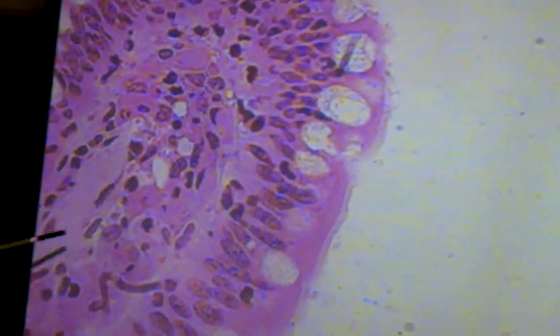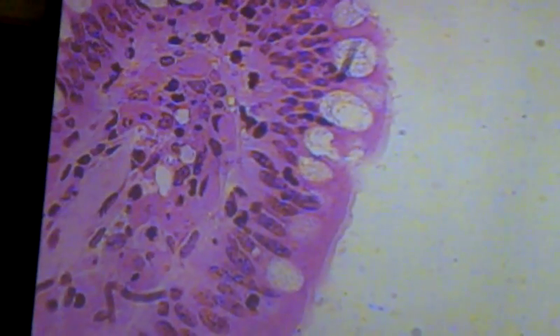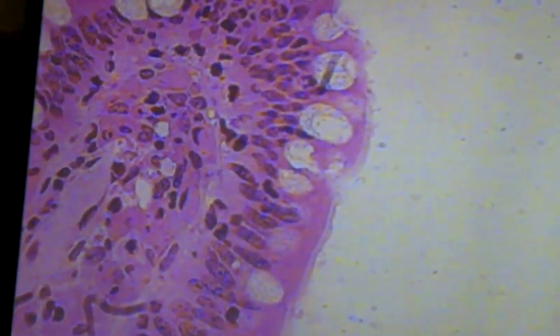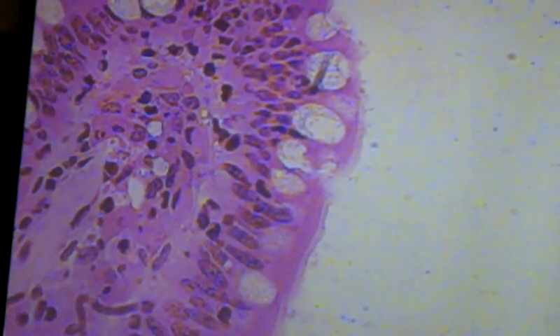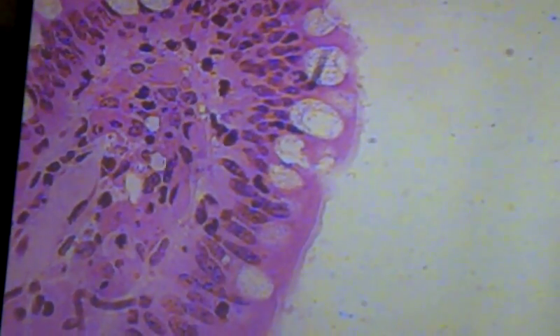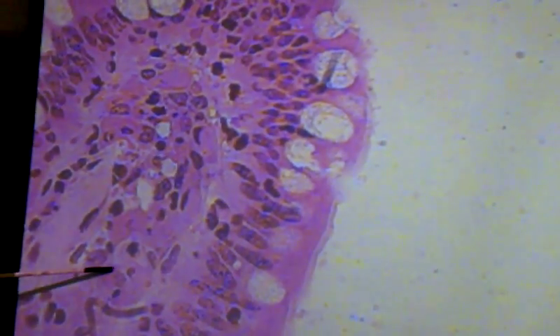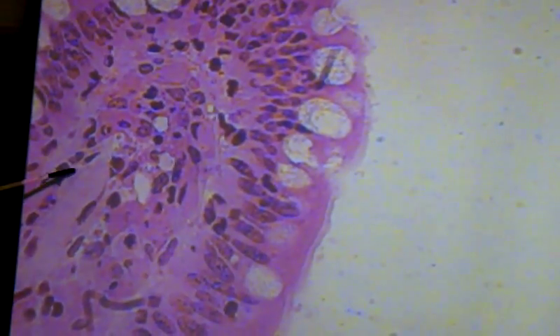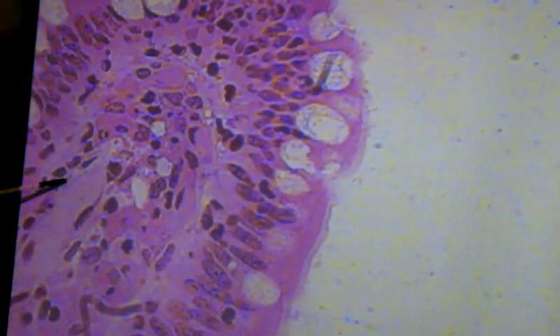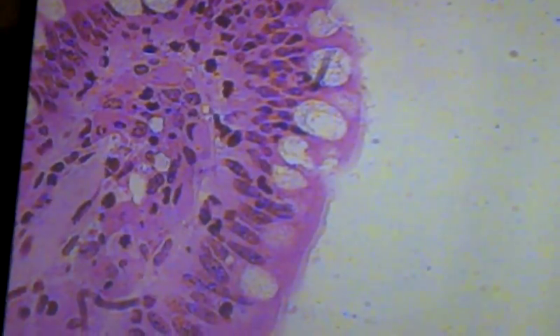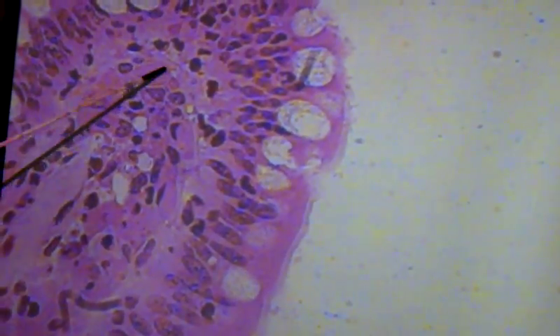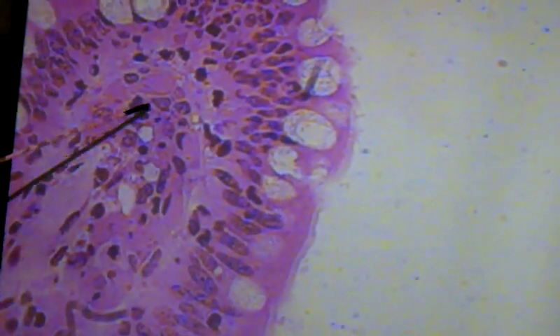Since it's so easy to see the boundary between the epithelium and what comes underneath, I need to name this too. This connective tissue under the epithelium in the mucosa is called the lamina propria. This appears to be a blood vessel — it's not very often that we see one cut lengthwise like this. Inside each villus there will be a little artery and a little vein, and typically there's also a lymphatic vessel in there too. Surrounding all that would be connective tissue of the lamina propria.